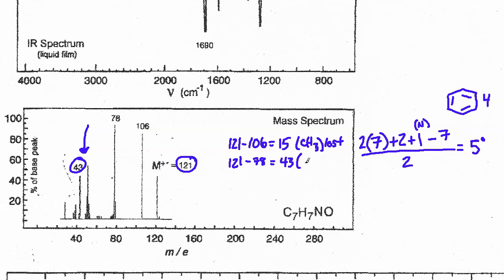Okay. And 43 is most commonly a carbonyl with a CH3. So it's an acetyl fragment. Okay, so the CH3, that already makes sense here, and then that's sort of being further confirmed by the fact we have a 43 fragment that's being lost, and that is most likely an acetyl fragment. That is what comes up most commonly there. So this should be easy to confirm because the IR should show us presence of a carbonyl if this is true, and then we'll obviously get confirmation of the methyl as we go down to the NMRs.